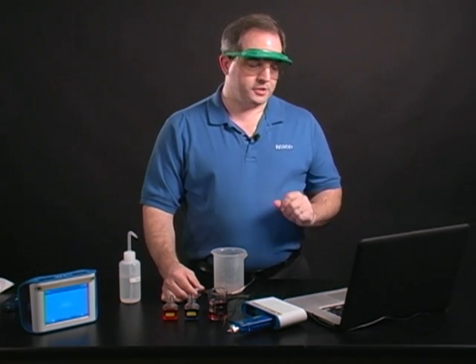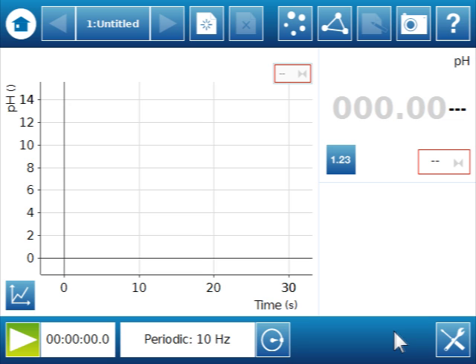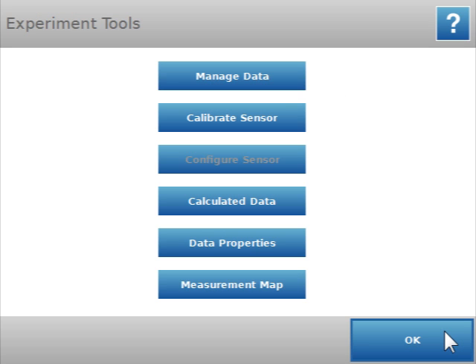That's where my calibration will be saved. I'm going to go down to the Tools in the lower right-hand corner, and that's where I'll find the Calibrate option. Let's select that.